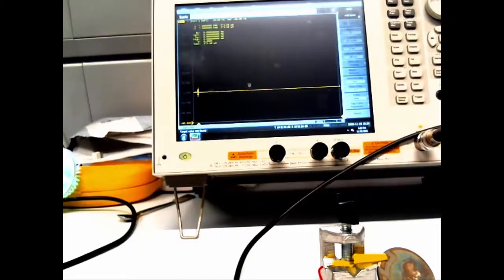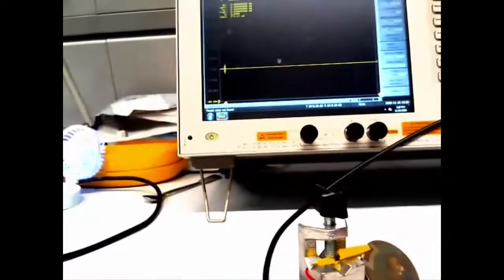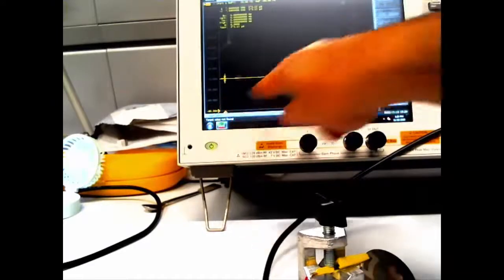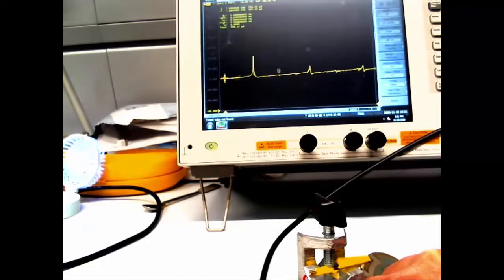So this is another crystal. You can see it's the driver part out of an ultrasonic bath. What you can see up here is a scale from 1 kilohertz up to 200 kilohertz, and if I apply this electrode you can see this peak grows in. I'm averaging over something, so that's why they grow in.